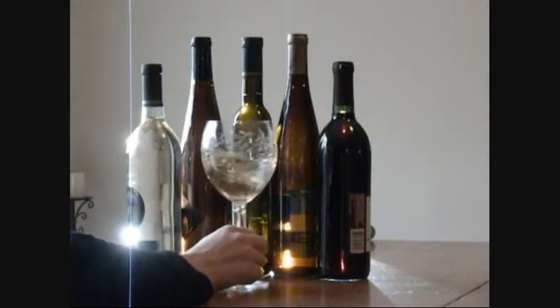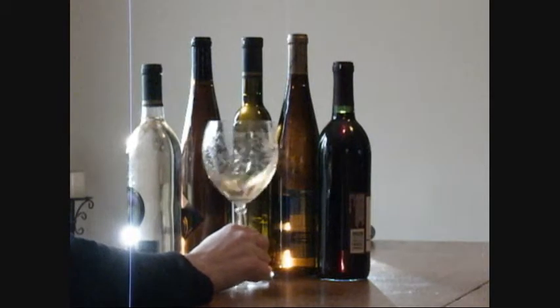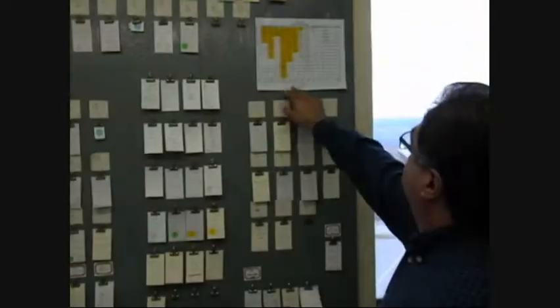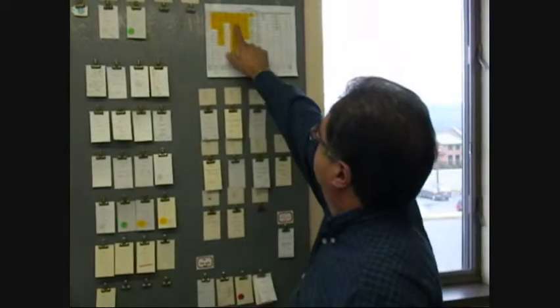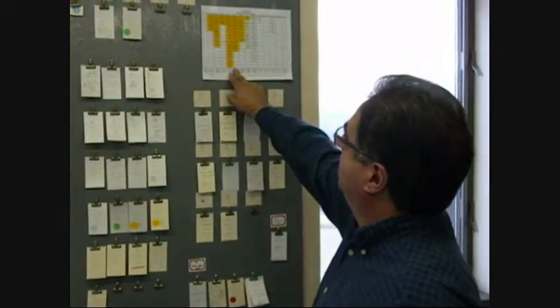To most of us, a great wine is determined by taste. To achieve the perfect flavor, a winemaker will run a series of scientific tests throughout the production of wine, starting with the selection of grapes and ending with bottling the finished wine. We meet up with Steve DeFrancesco, winemaker at Glenora Wine Cellars, to learn about the chemistry behind the taste we all love to savor. While there are a number of lab tests Steve conducts throughout the wine production, he explains to us the importance of testing stability levels, pH balance, and sugar before fermentation.